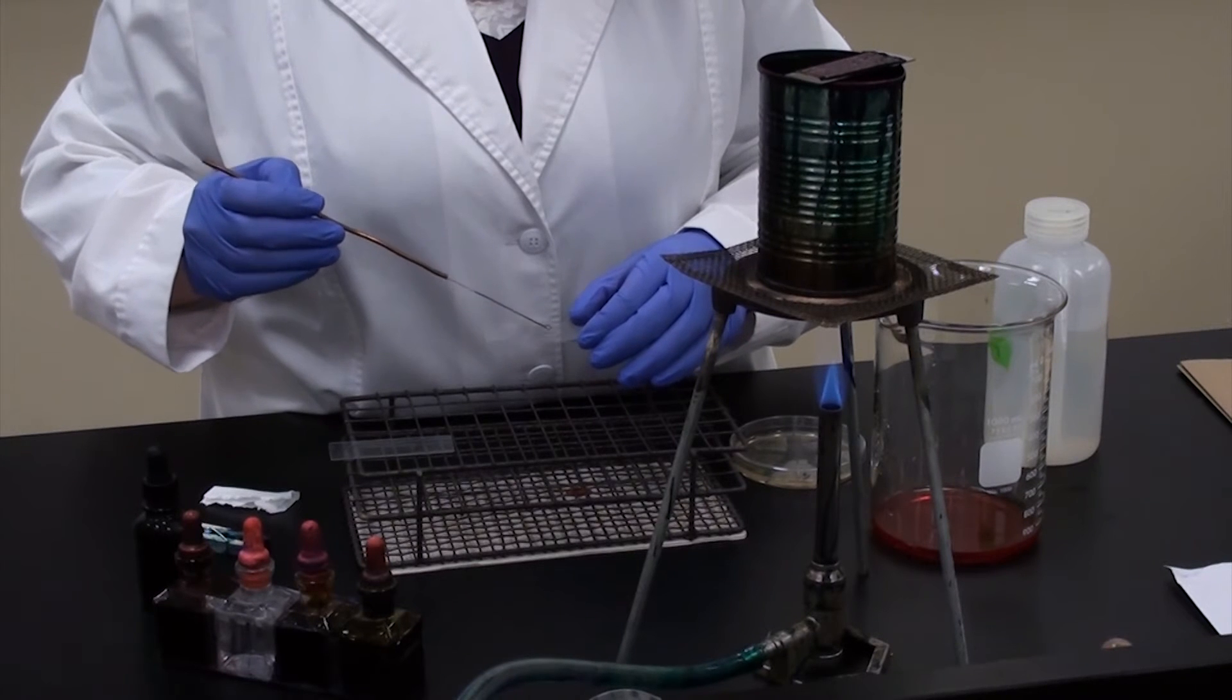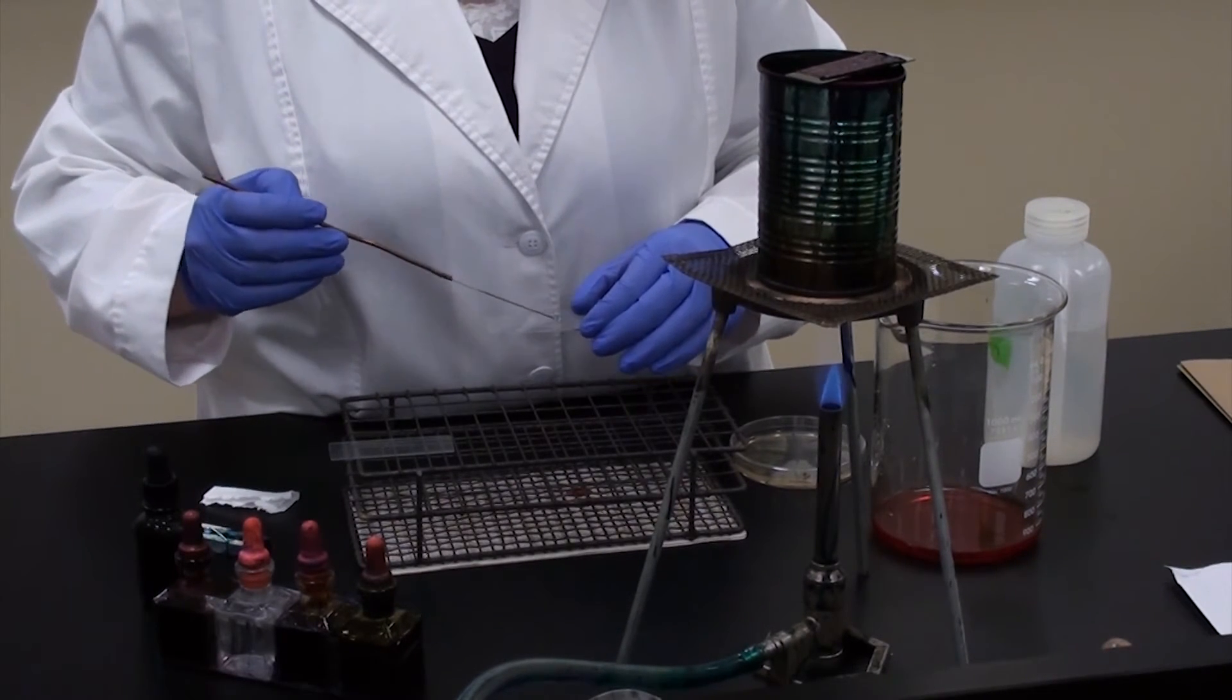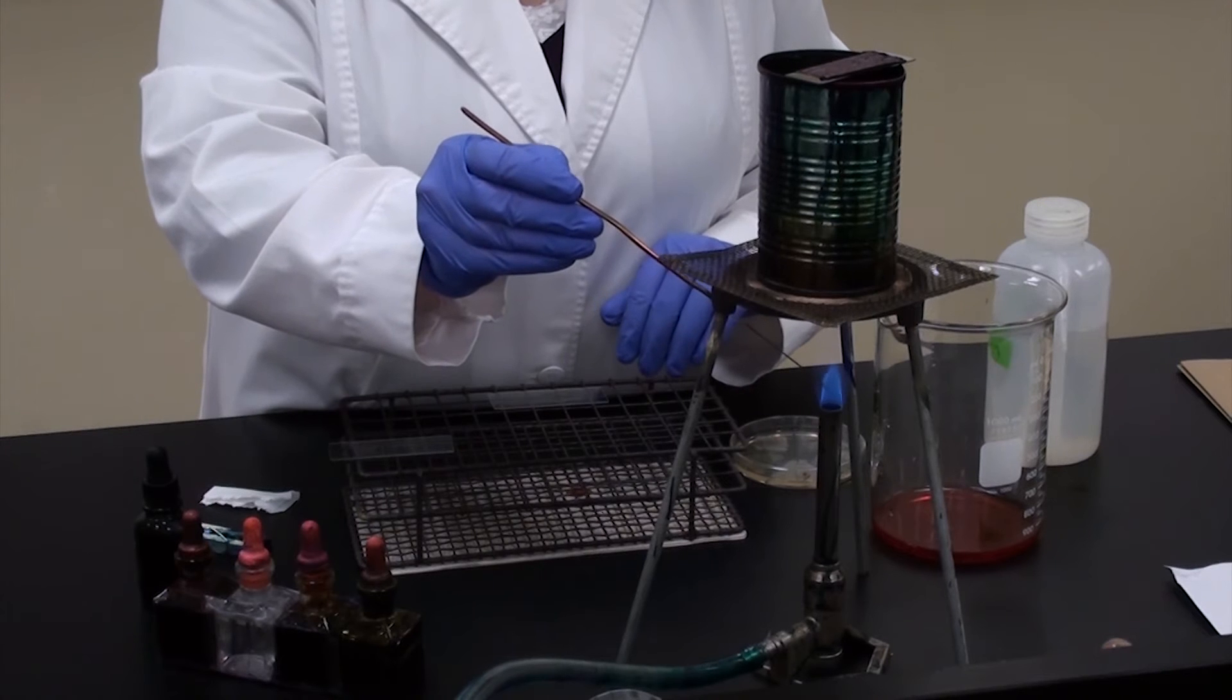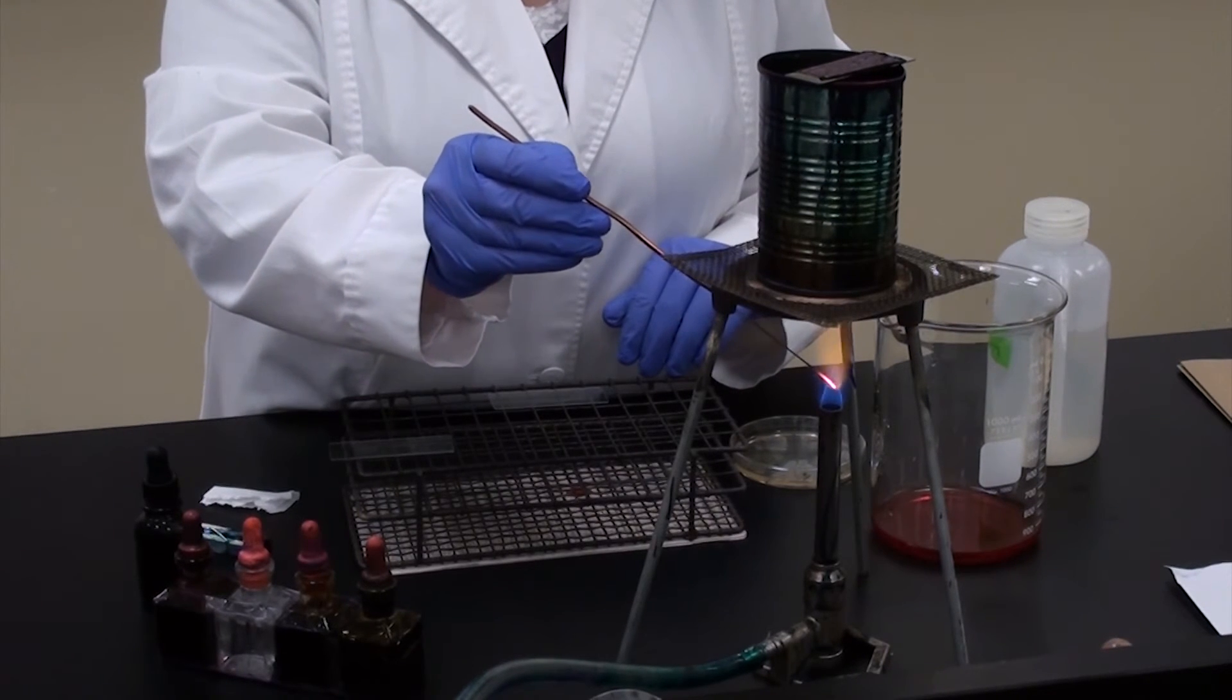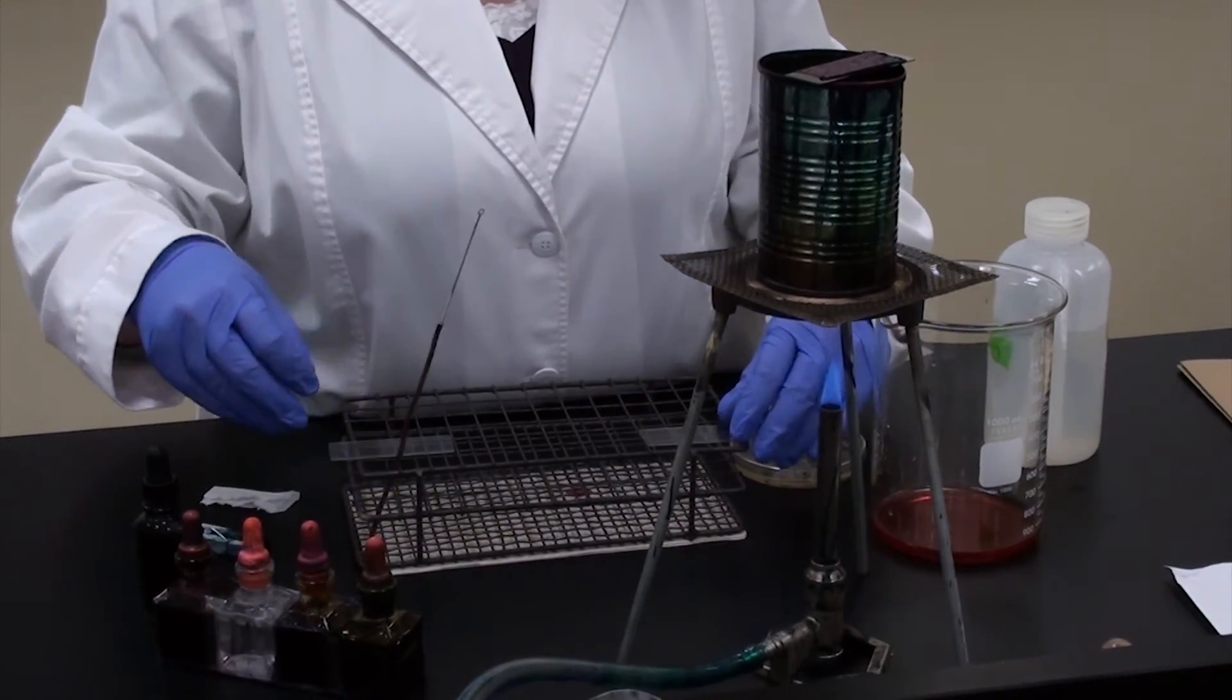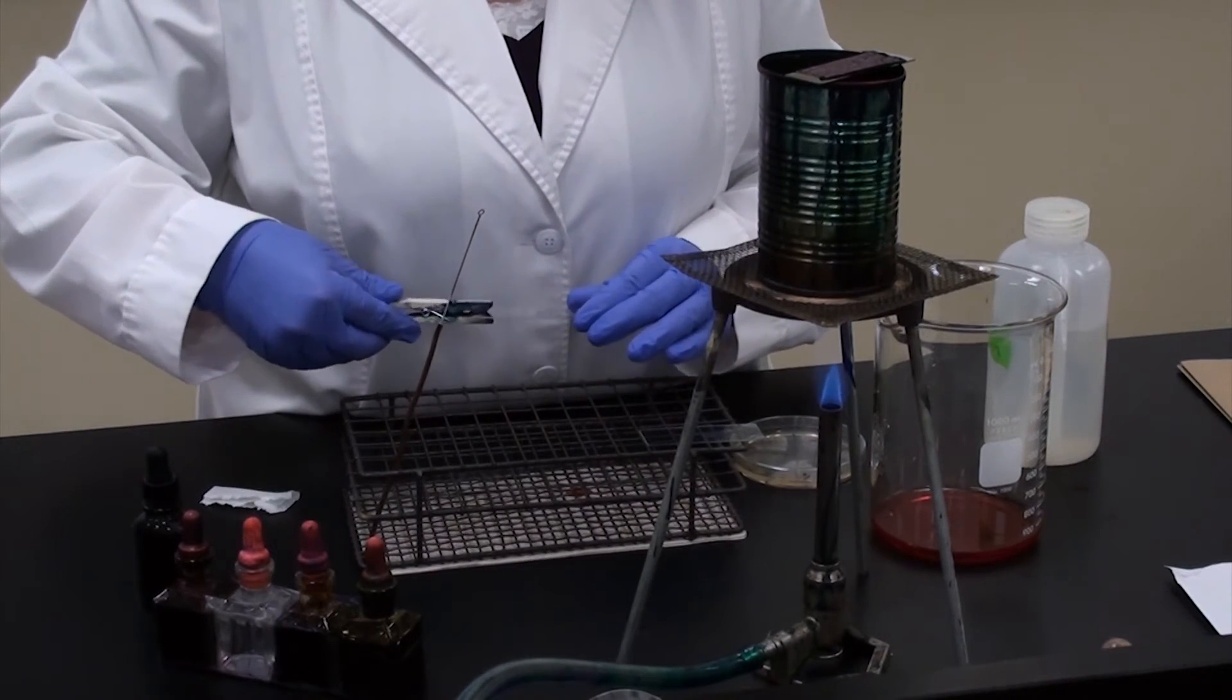Again, transferring it to the single drop of water and spreading it around on my slide, nice and thin. Then reflaming my loop and setting the slide off to air dry completely. Now I've already prepped a slide and allowed it to air dry, so I'm going to heat fix the organism to the slide.